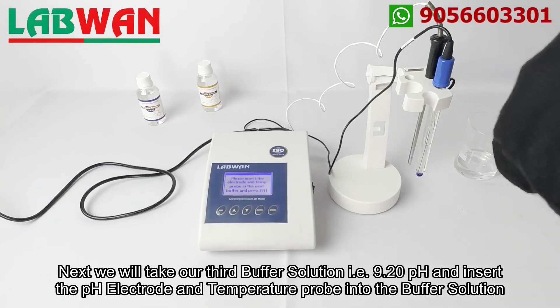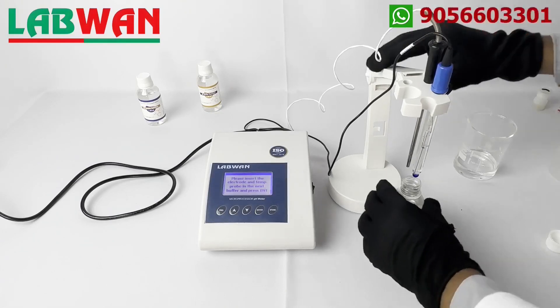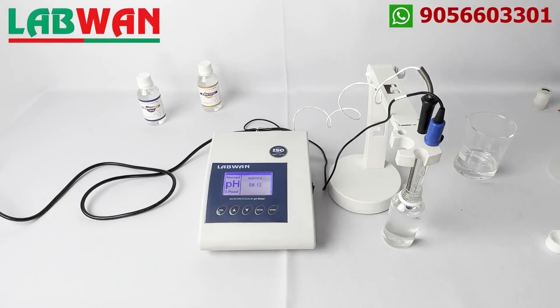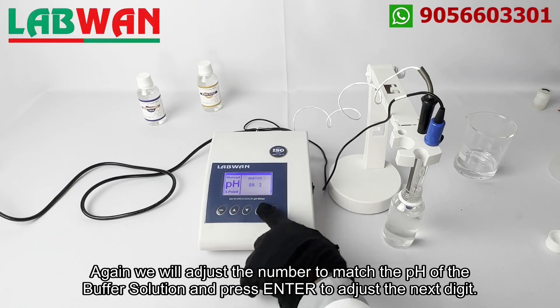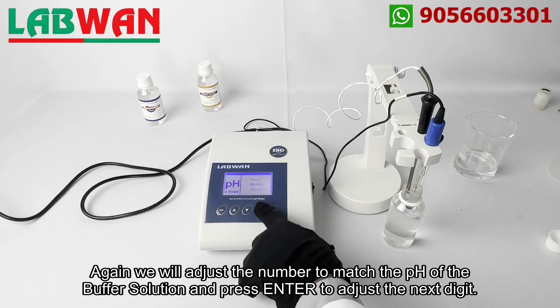Next we will take our third buffer solution, that is 9.20 pH, and insert the pH electrode and temperature probe into the buffer solution. Press enter as indicated on the screen and repeat the process used in previous calibrations. Similarly as the first calibration, the tens digit will start blinking indicating it can be adjusted, and as our pH buffer is of 9.20 pH we will skip the tens and ones digits by pressing the enter button as they match with the pH of the buffer solution. Again we will adjust the number to match the pH of the buffer solution and press enter to adjust the next digit.